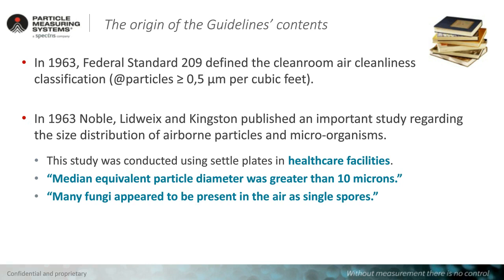Another aspect is that these people learned that fungi appear to be present in the air as single spores, mainly when they are in the environment. We all know that we have fungi present in our cleanroom environments.